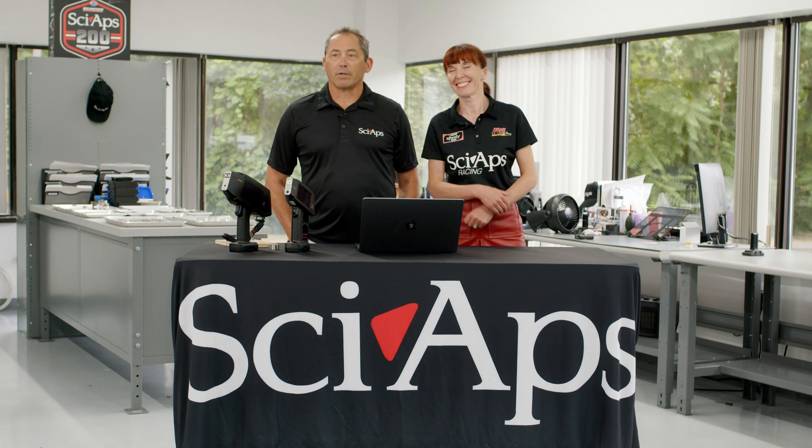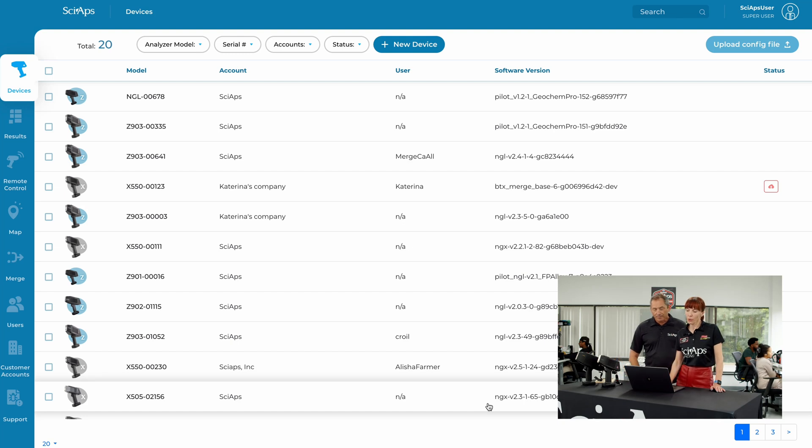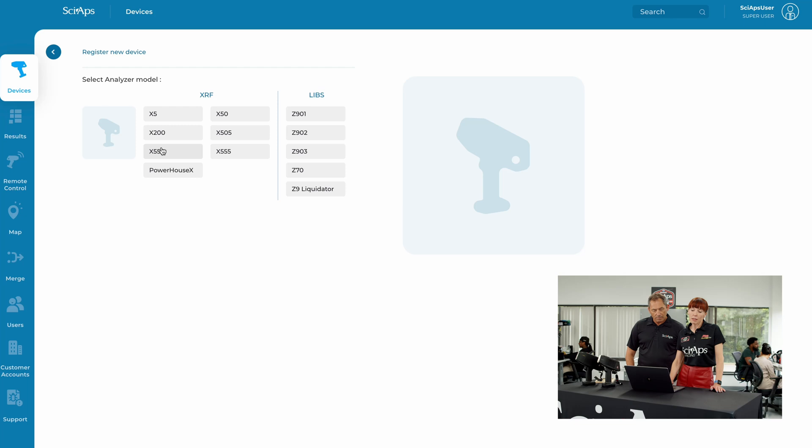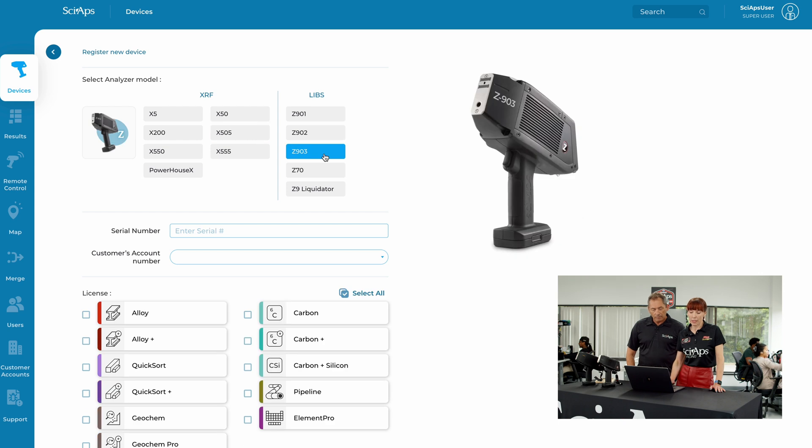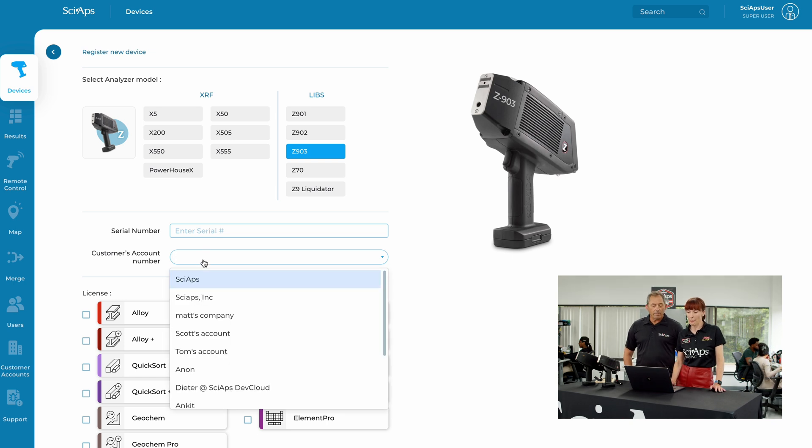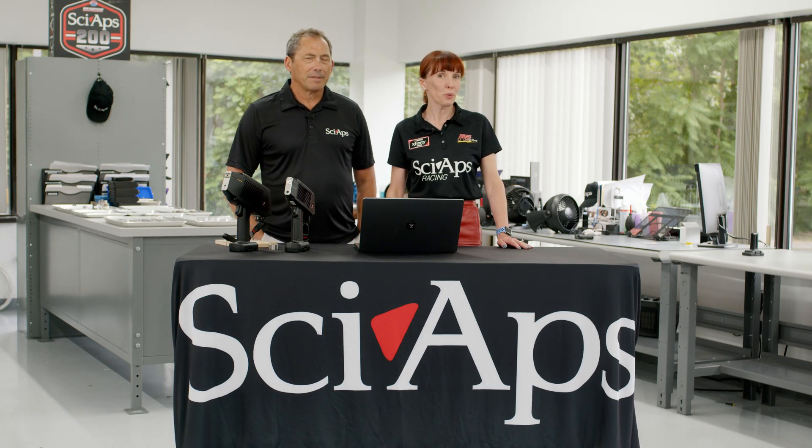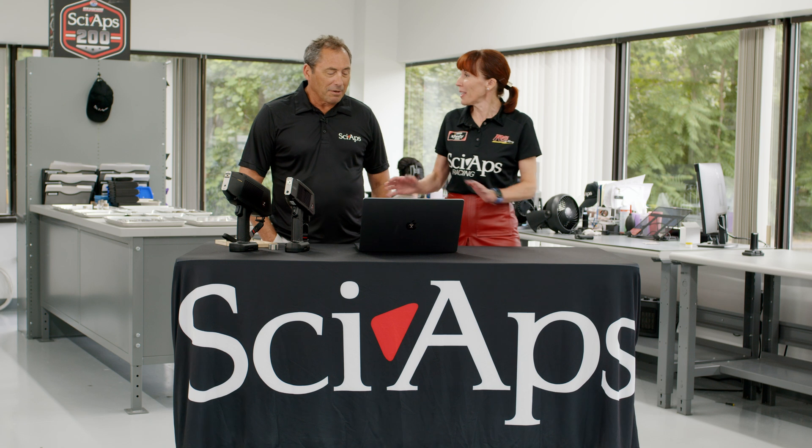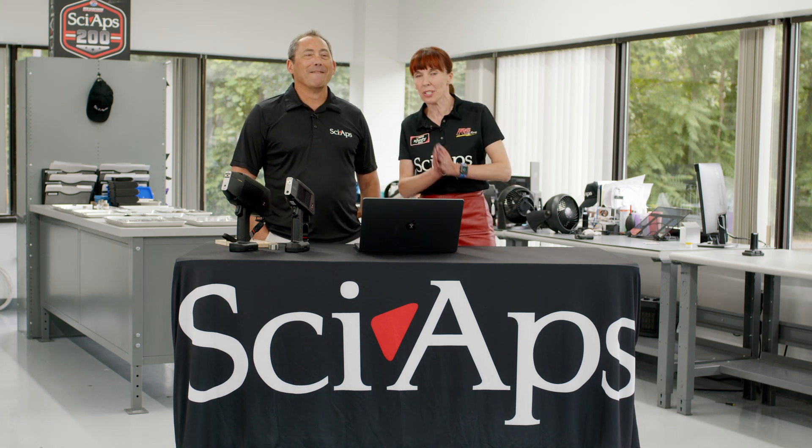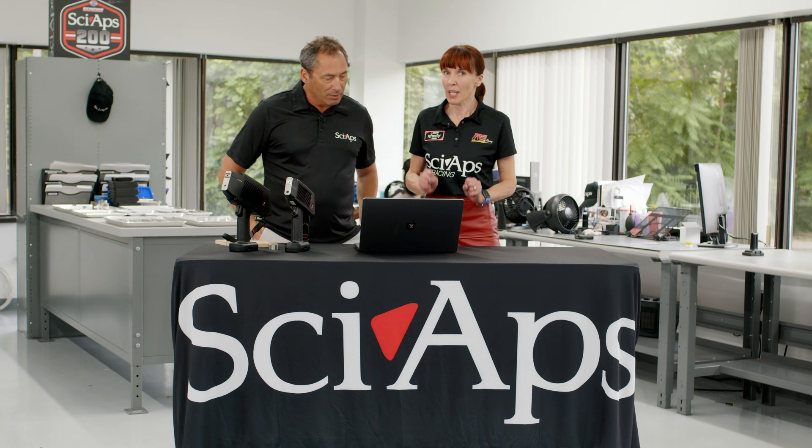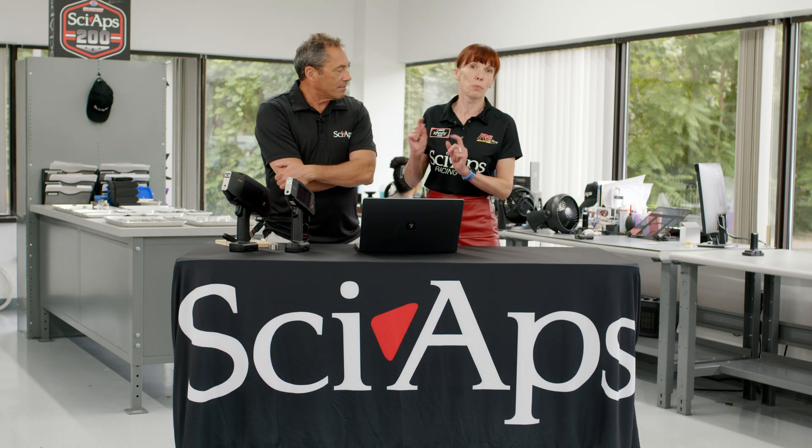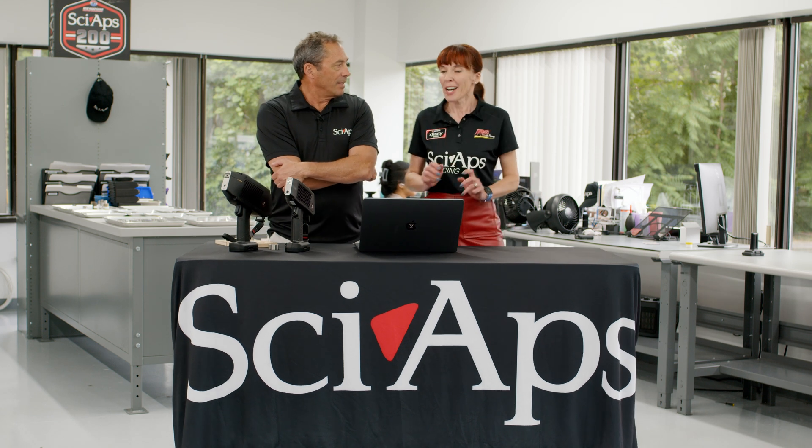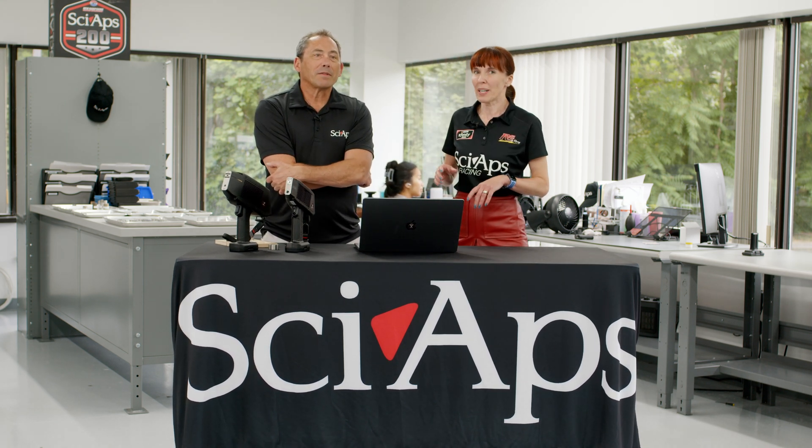Very important. Push software updates. So what I want to show you right now is what devices we support. As you can see here, we have XRF and LIBS models. You could click on each of them and you could see what applications are supported. You could type serial number, register your device and assign to a particular account. So every model we make is cloud enabled? Every model is cloud enabled. Did I just say that? Yeah, you did. It's a good statement because we share code and the same protocol used for all device types. It's very important because it's so easy to add a new model, which happens all the time. We constantly innovate, which is great, right?